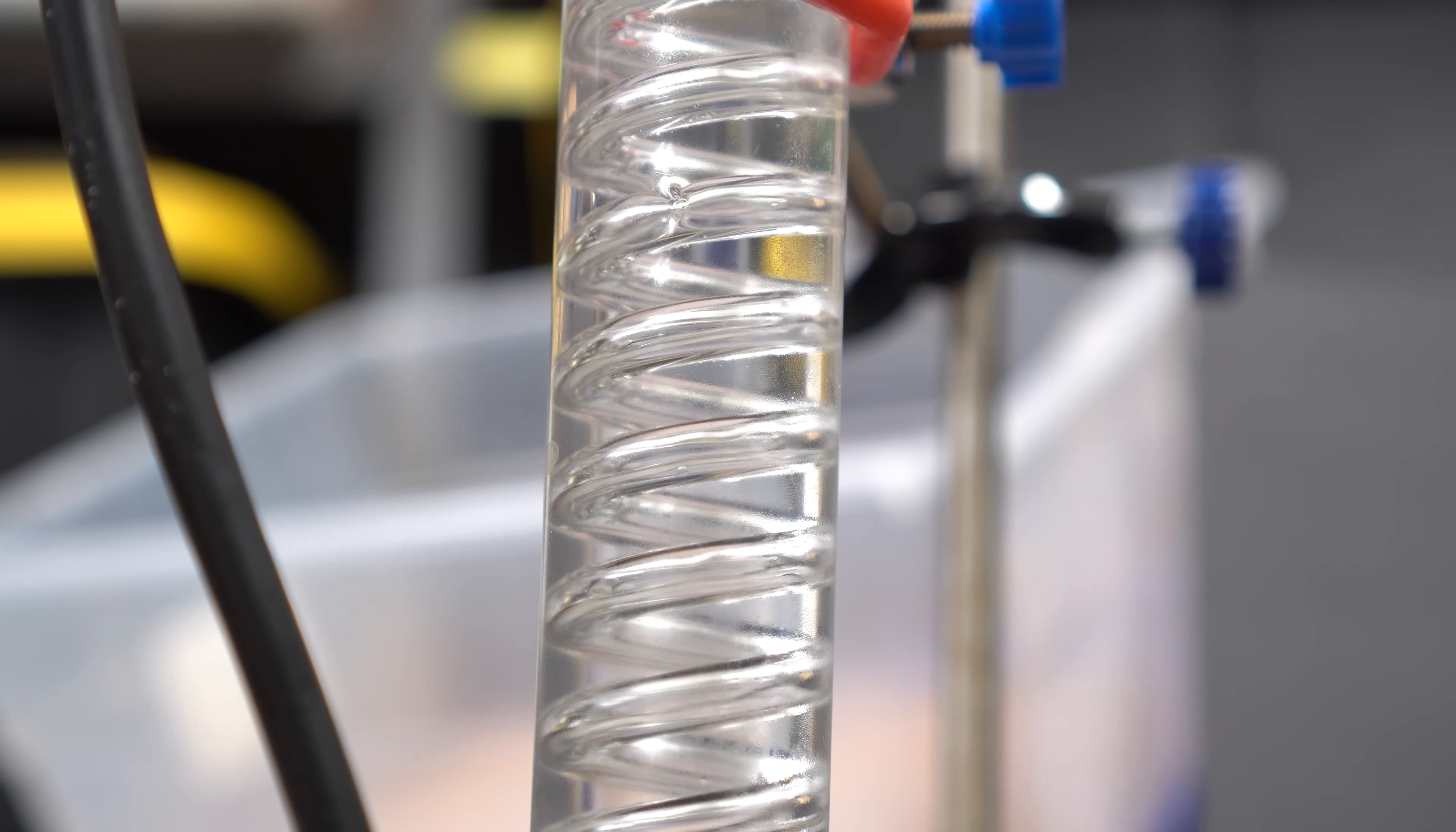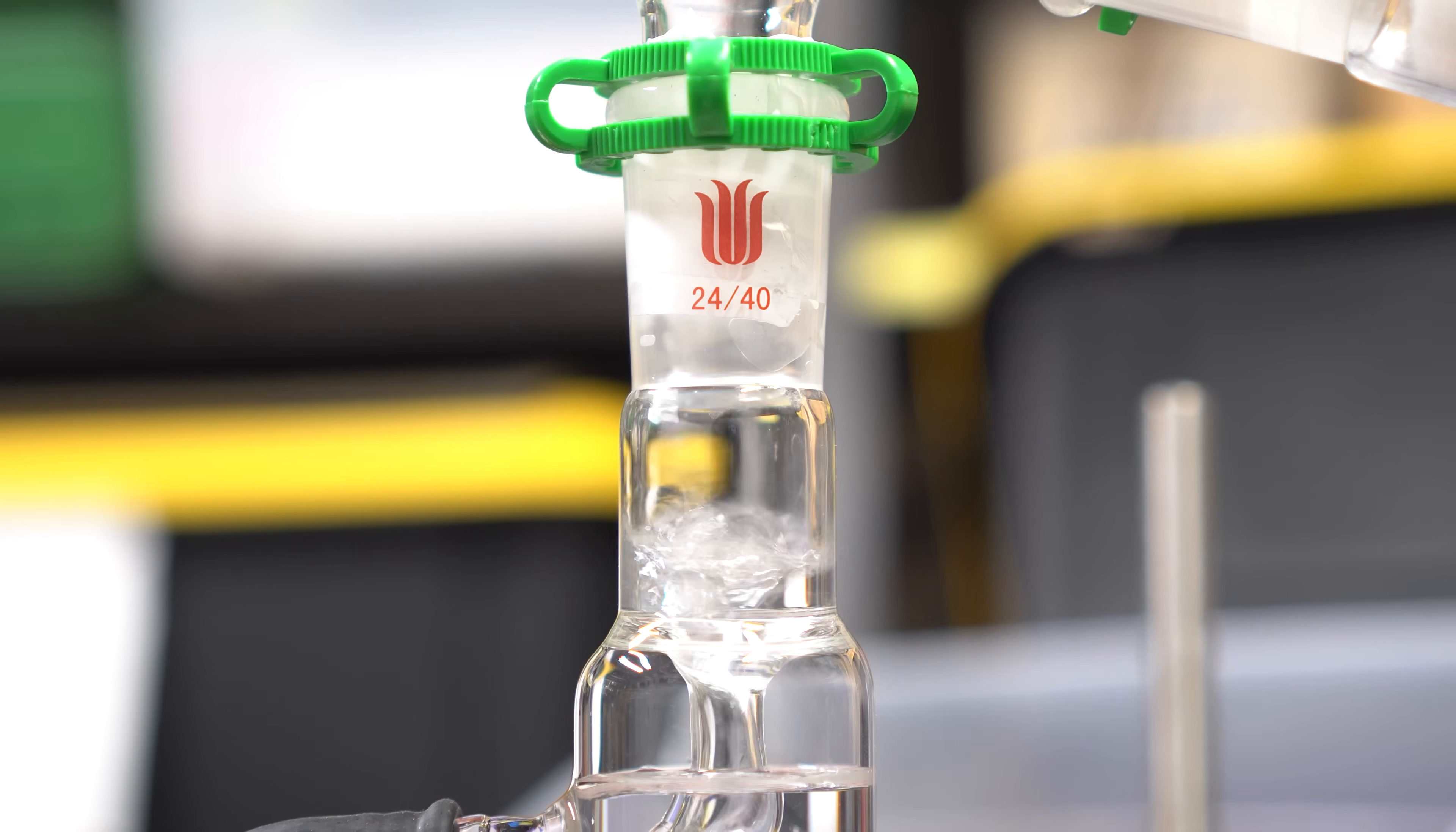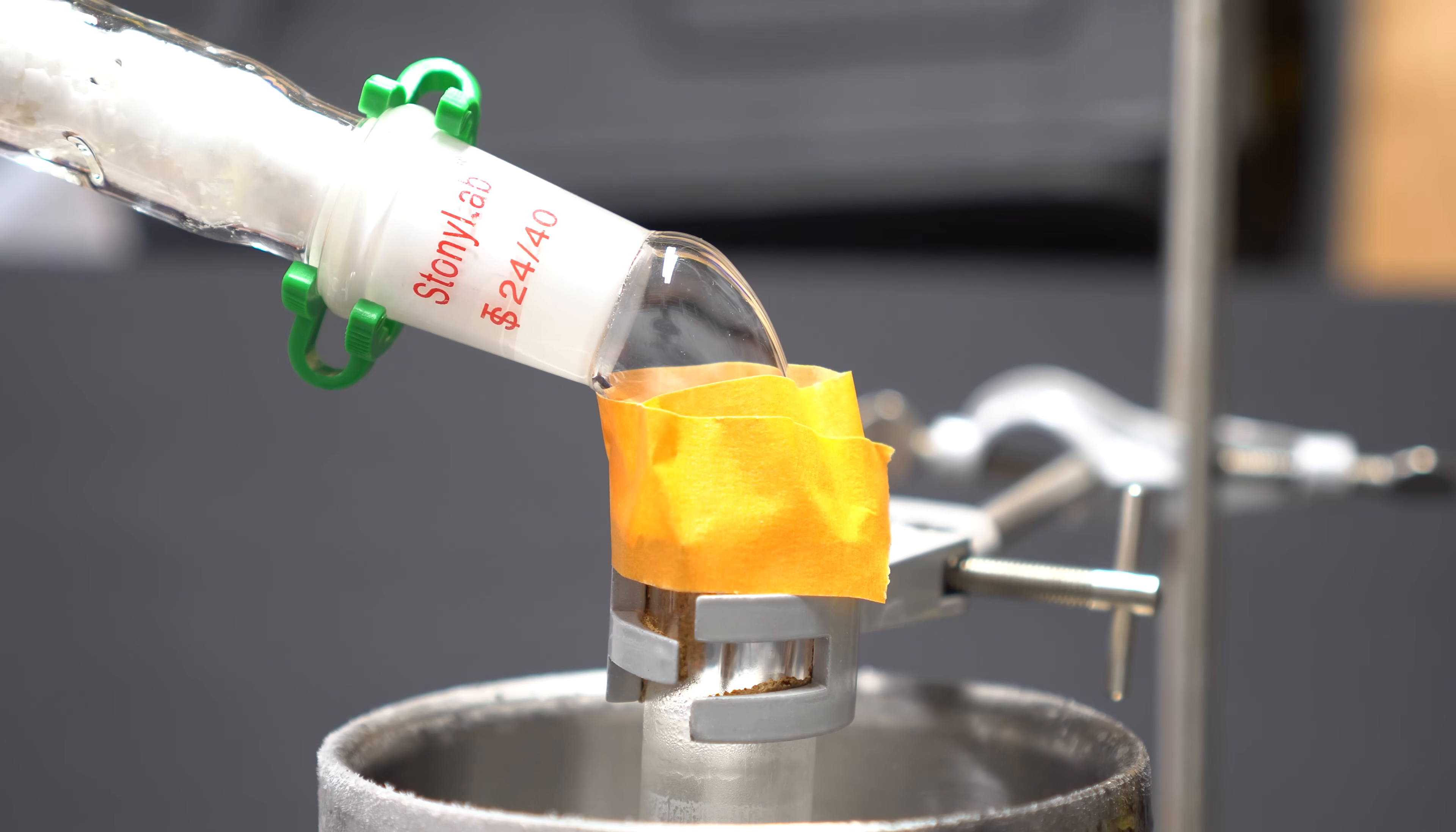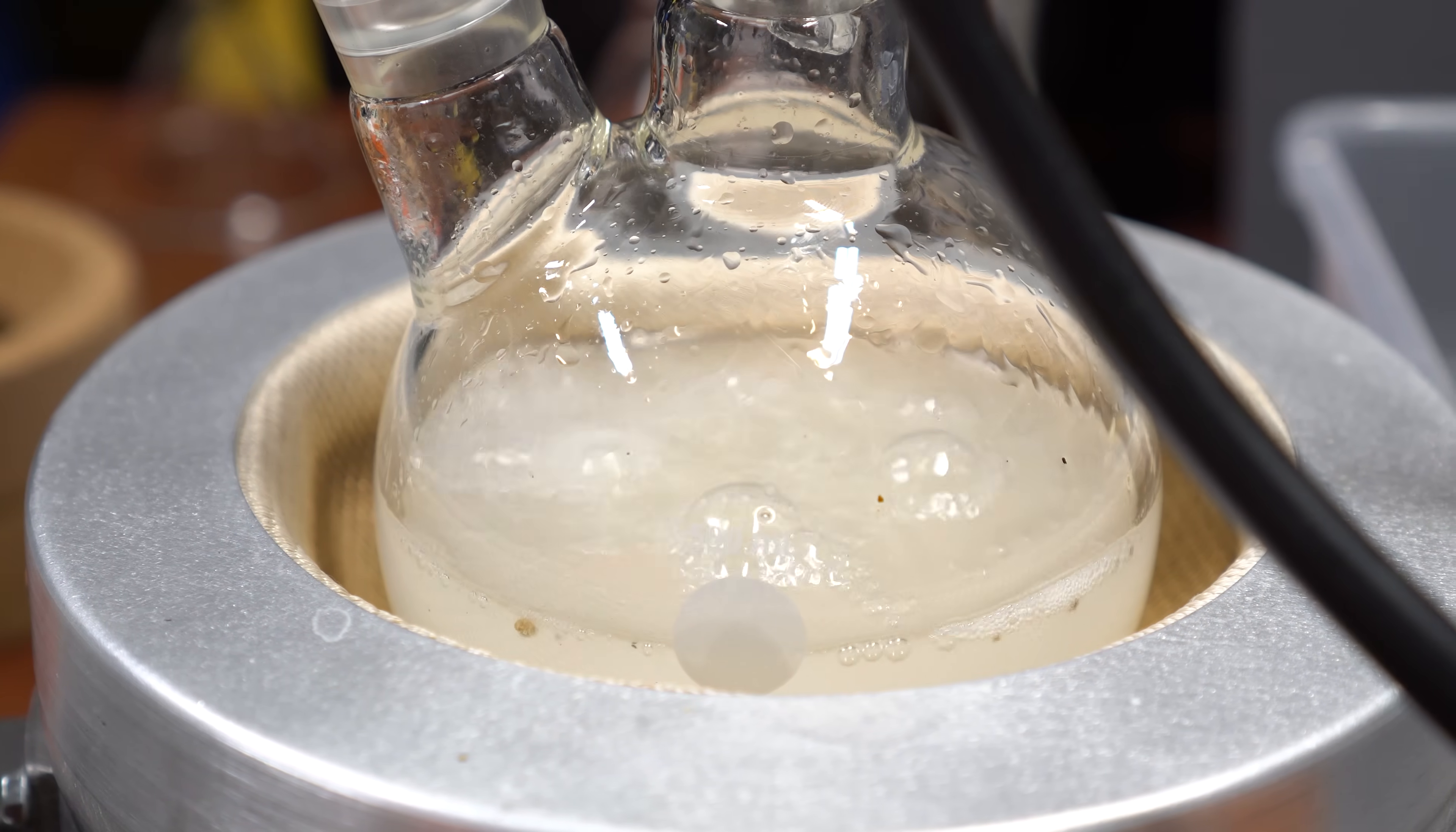I actually cranked the heat up too much and a lot of water was making its way up the tube. There was so much water vapor going up the tube that water was erupting out of the top of the Graham condenser. I was worried about it going over the horizontal condenser. I had to turn the heat down, but luckily no water made it over. The ammonia gas being liberated is being dried by the potassium hydroxide, which is highly hygroscopic and attracts and holds water molecules from the surrounding environment.